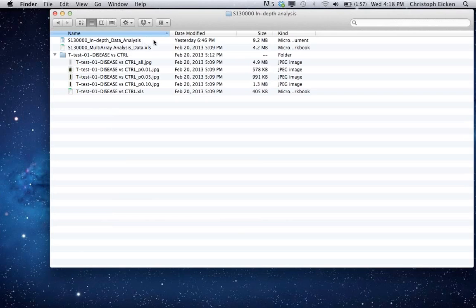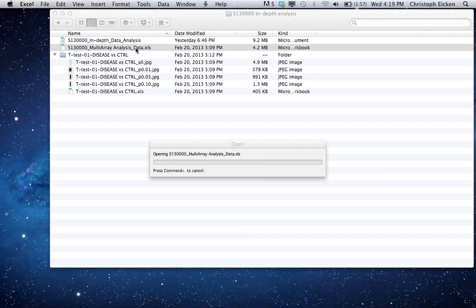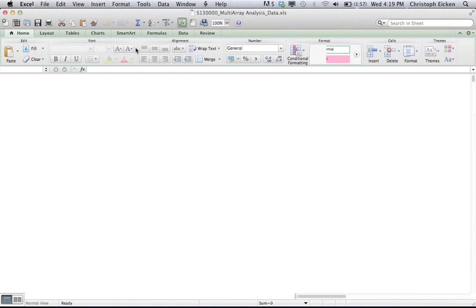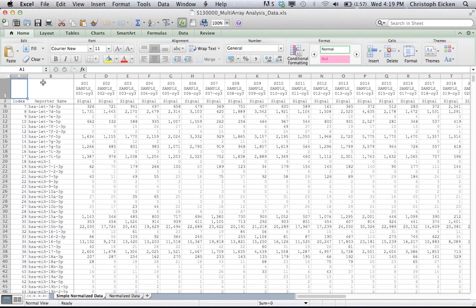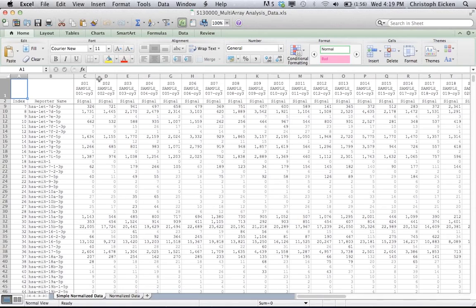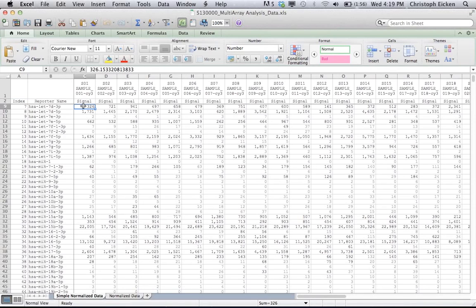The most important file here is the so-called multi-array analysis data file. What is this? It contains all the normalized signal intensities. So basically here you have two pages, simple normalized data and normalized data. The simple normalized data lists all the microRNAs here in the second column and then all the individual samples. What you see here are the signal intensities that are based on the mean of the probe repeats after normalization. So you can directly compare them.